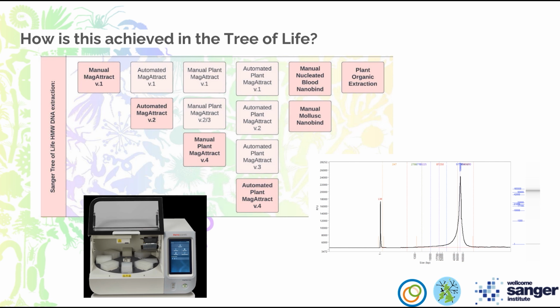Okay, after homogenization, we have the actual DNA extraction. So as you can see, there's a lot more protocols here. The ones that are in bold are ones that are currently in use, and the ones that are slightly faded are previous ones that we've since deprecated. We actually have more that we need to add onto here, and you do need lots of different protocols, and you need to do quite a lot of trial and error to make sure that you've got the right protocol for the right specimen.